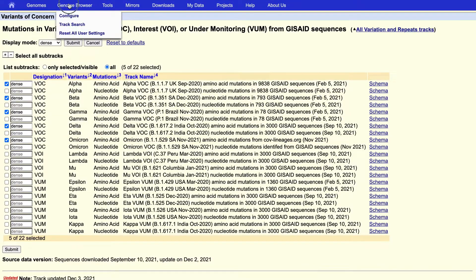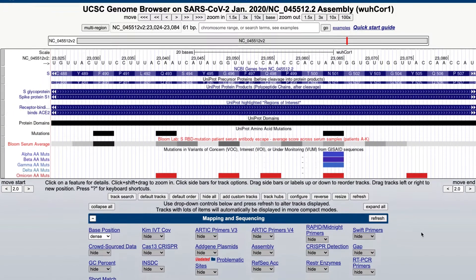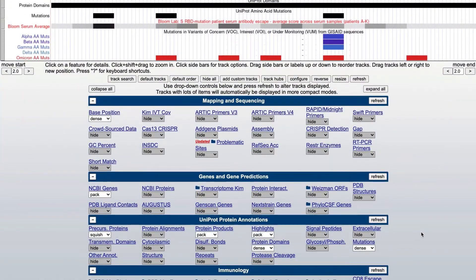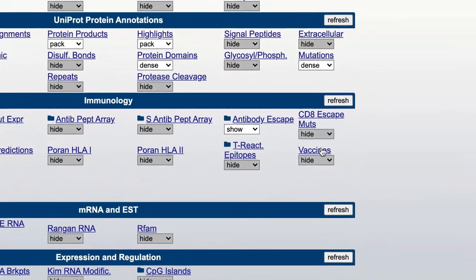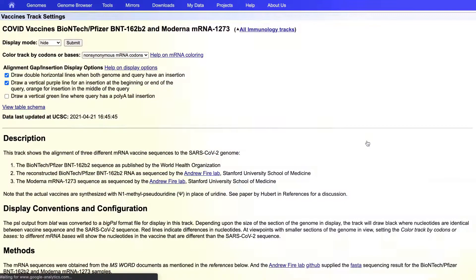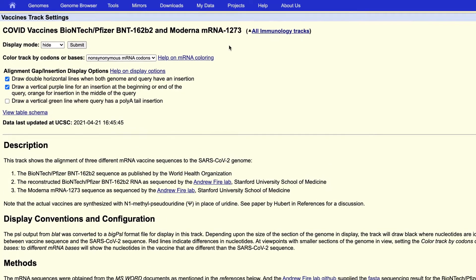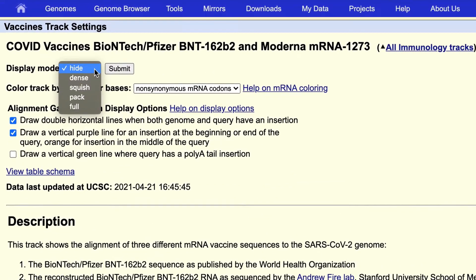Another way to explore the available data is to scroll down to see the complete list of available tracks. Hover over a track's title to see a longer title for it, and click on the link to view the documentation. To view the track's data, change its visibility setting from hide to one of several other progressively more expanded modes.